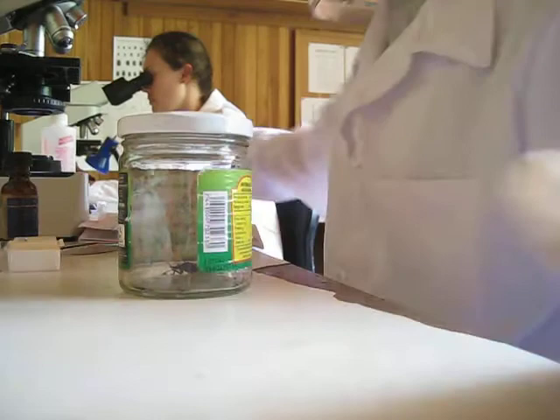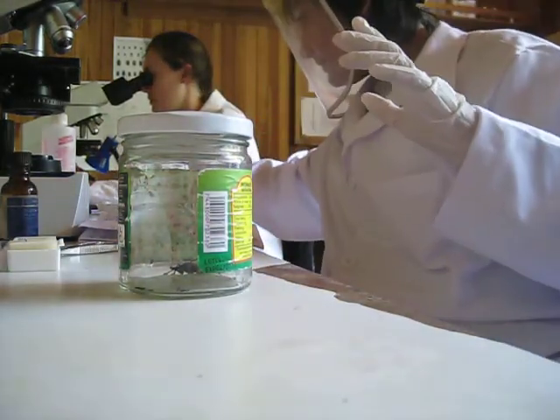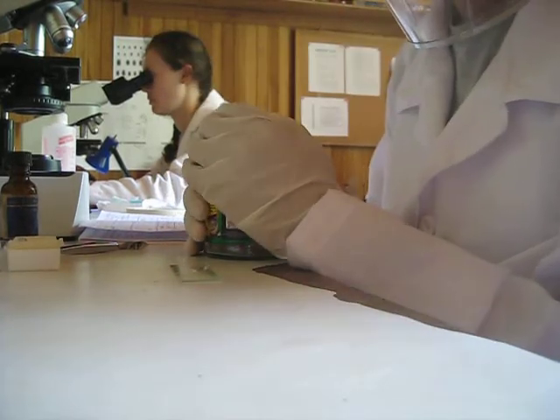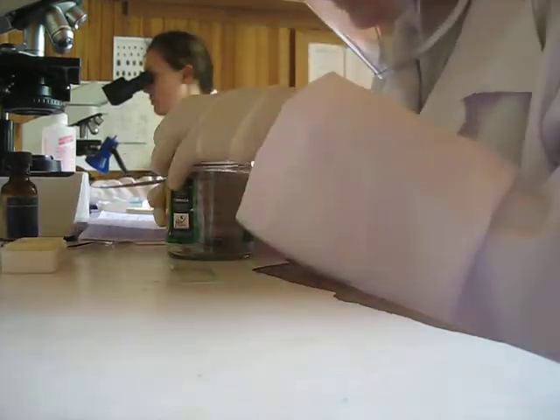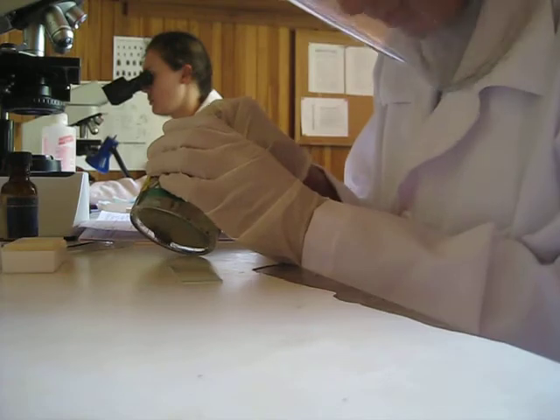We're going to need some slides and cover slips. So I have my Chagas Bug here. You need to be very careful because some of them are positive for Chagas Disease. They give off a horrible odor as they're afraid, as you will see shortly.